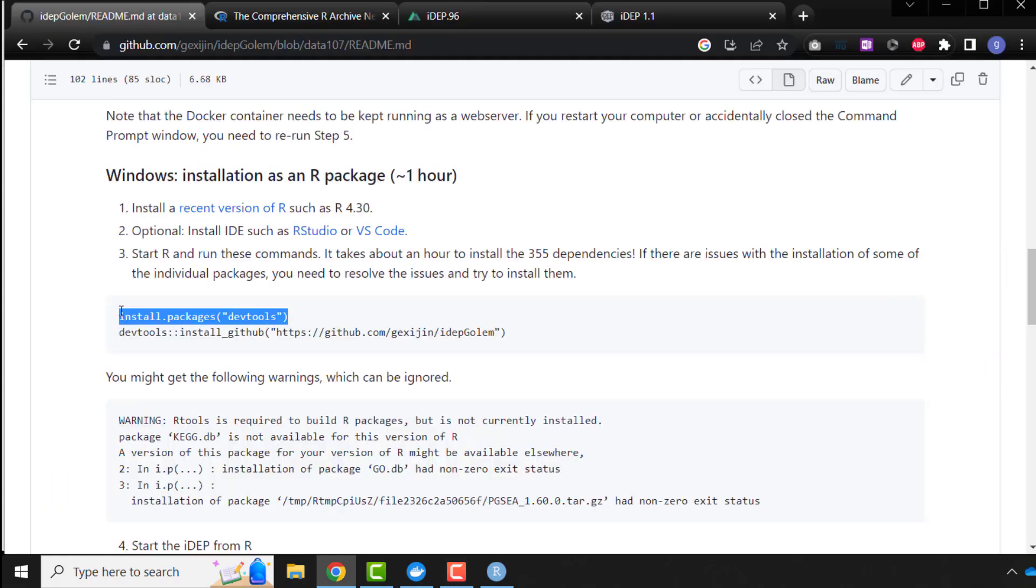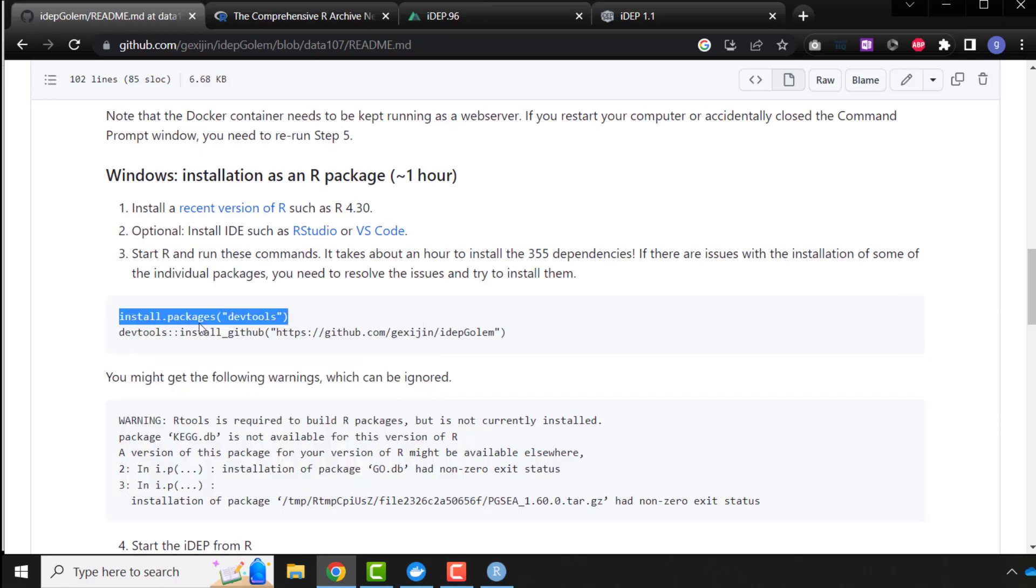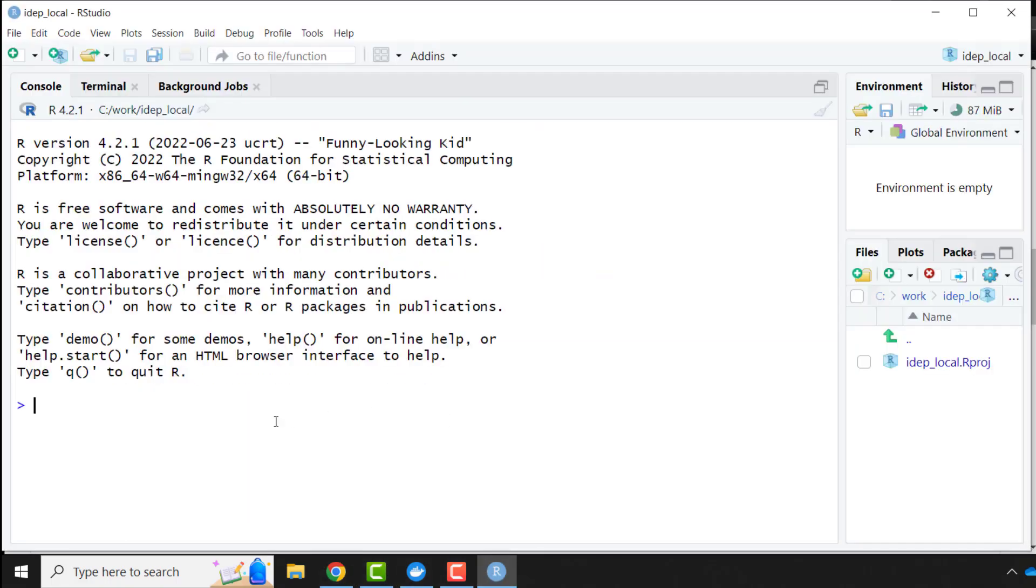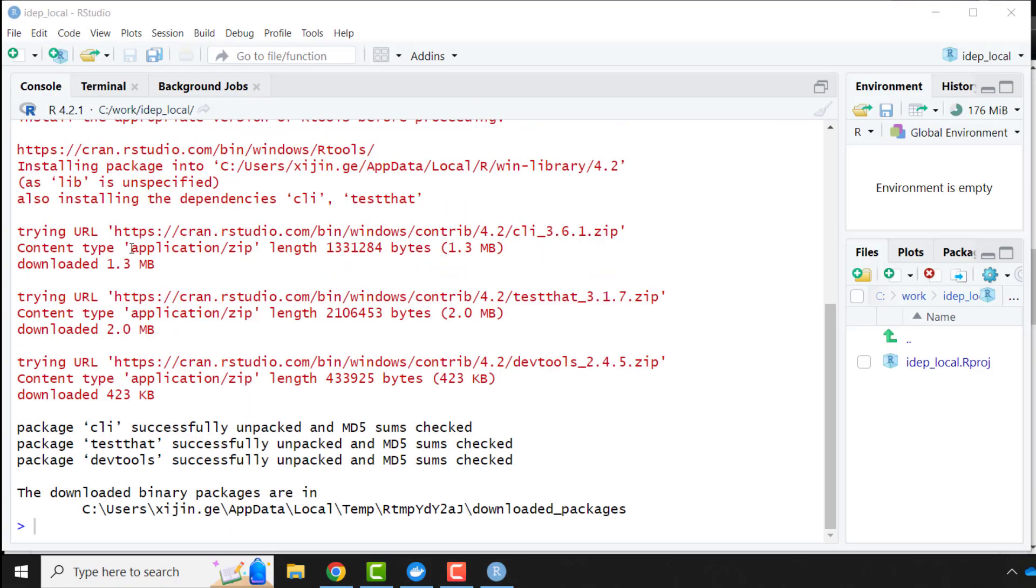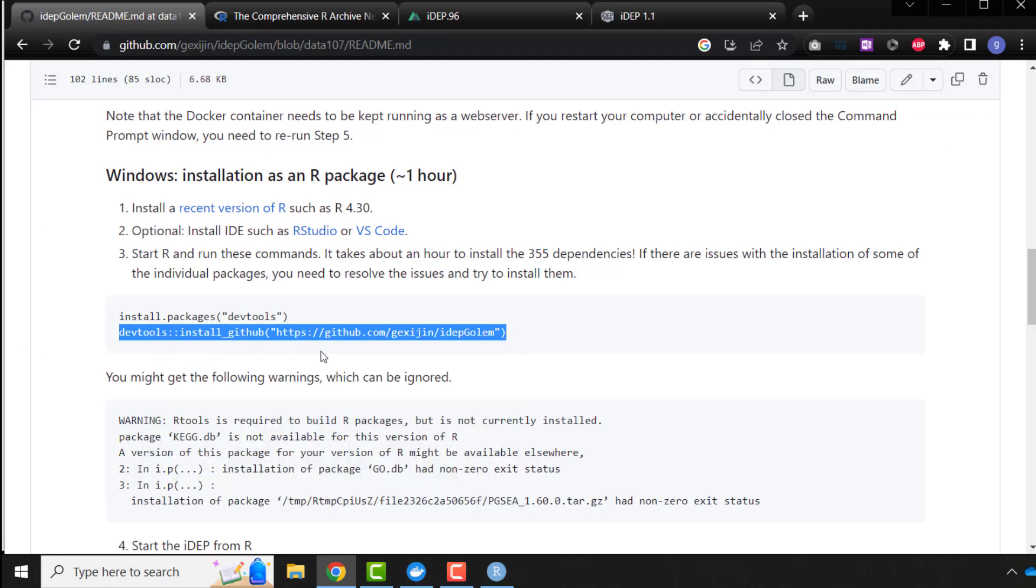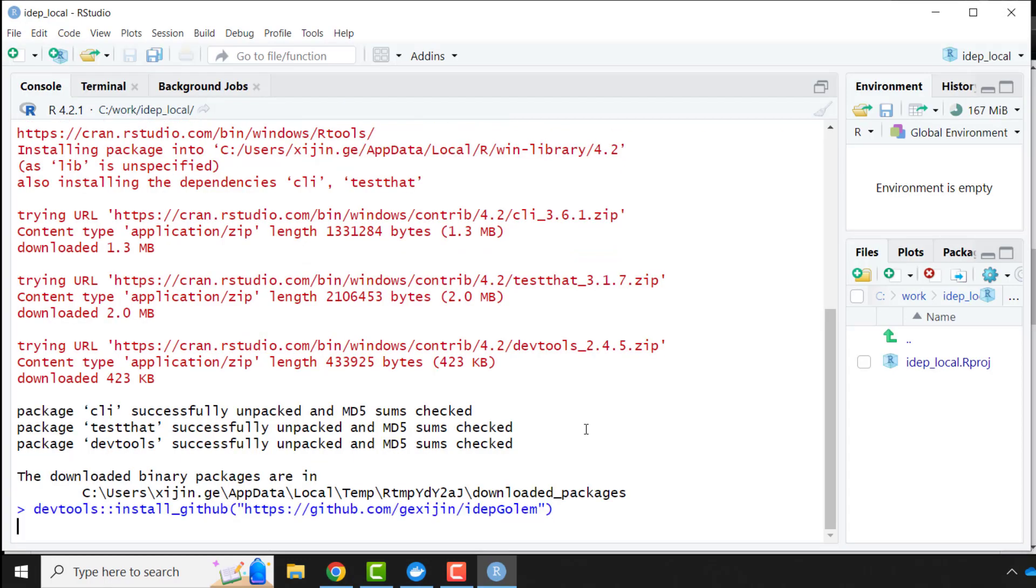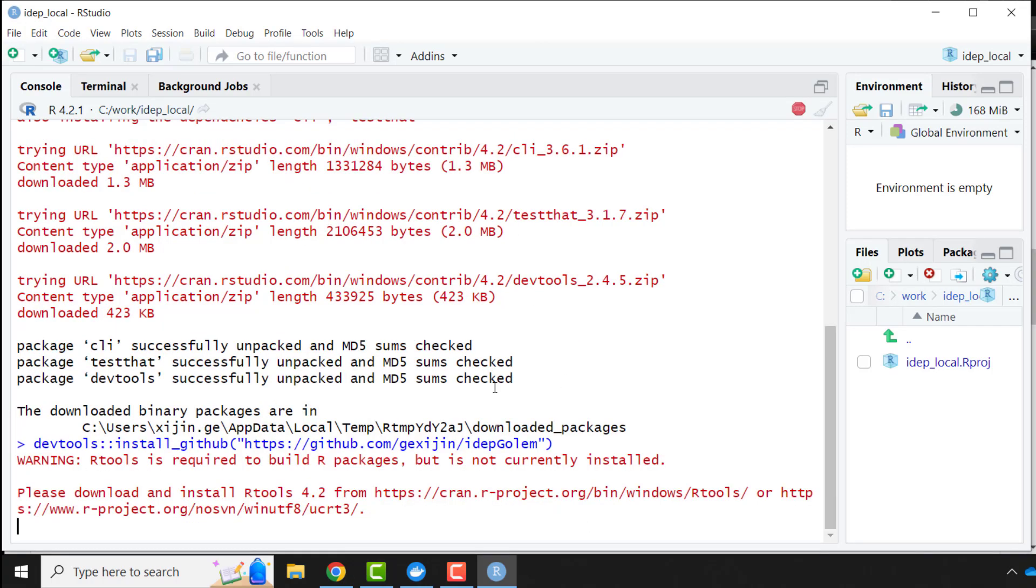So first, we install the DevTools package. Install DevTools package, so it's finished. So DevTools install GitHub. So we're going to paste in here, and I'm going to start this install process. So it takes a long time.